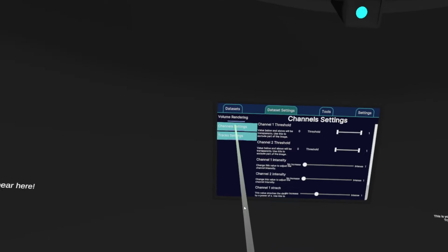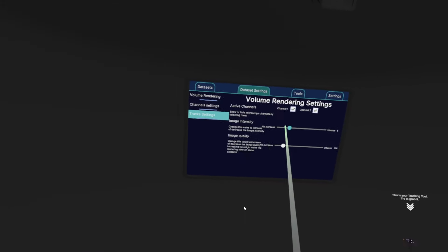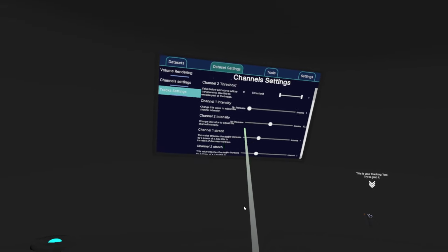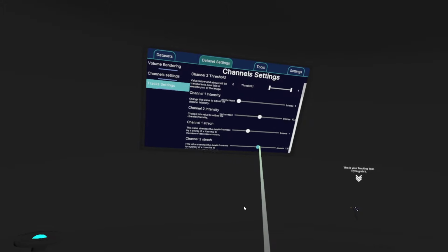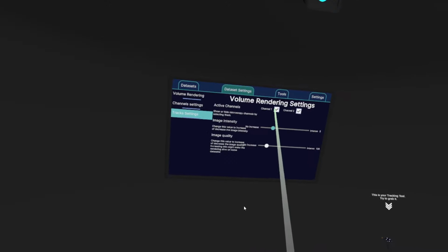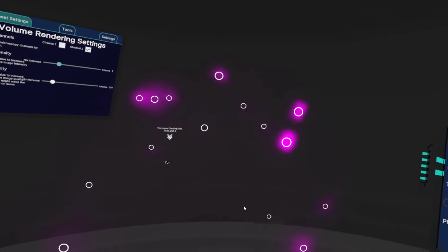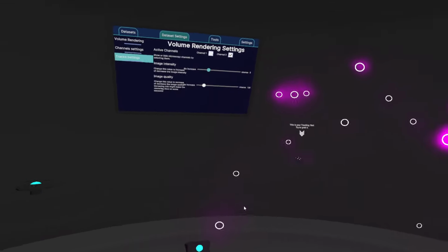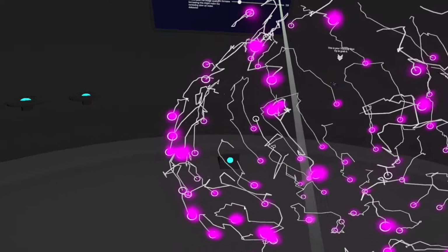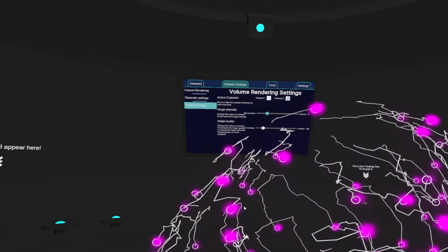And we are going to go and just adjust a little bit of the intensity setting for this particular dataset. And I'm actually going to hide the membrane. So I'm only going to keep the nuclei setting. All right. So now I only see the nuclei and I see the annotations. So if I go forward in time, I can basically see my annotation over each of the nuclei in time. And this is nice, and I can see what annotation I've done in Mastodon.